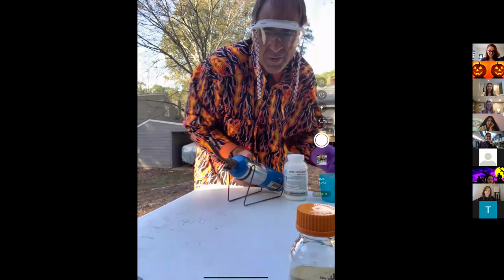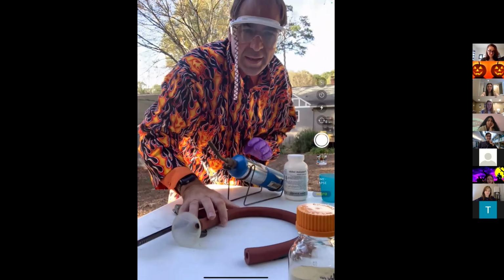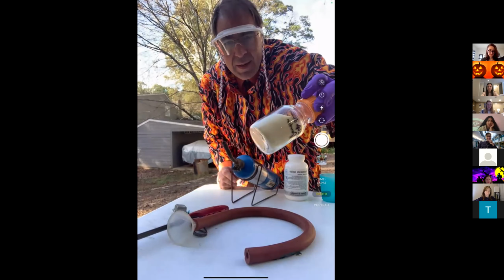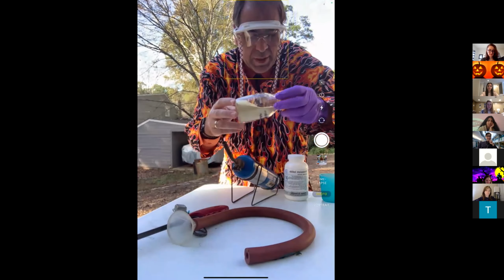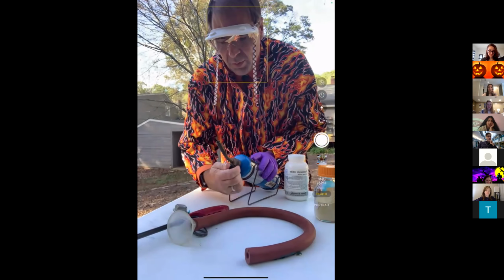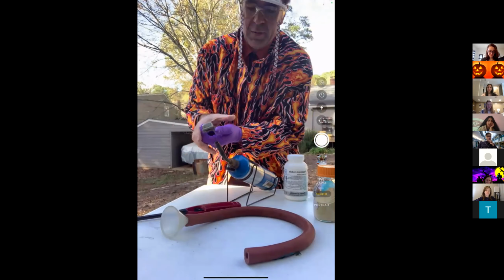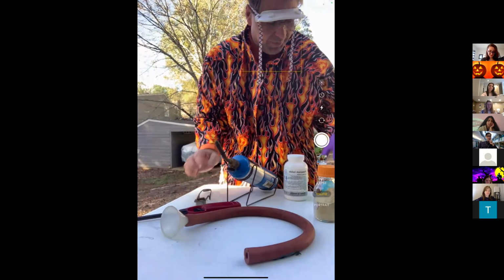I just love the kinetics lab. And that is lycopodium powder. I have this in our plant spores. I'll be filling my yard with it too. Well, the trees will be filling my yard with it too. What we're going to do is send these through a funnel and see what happens if we do that.